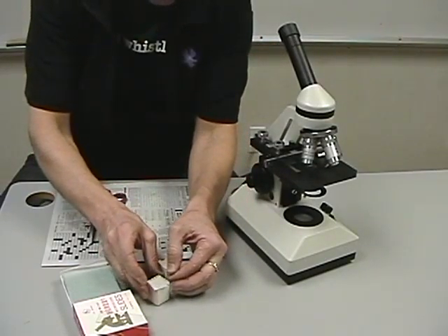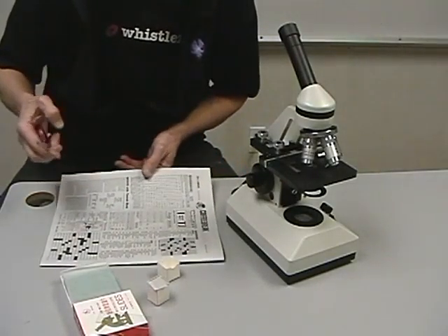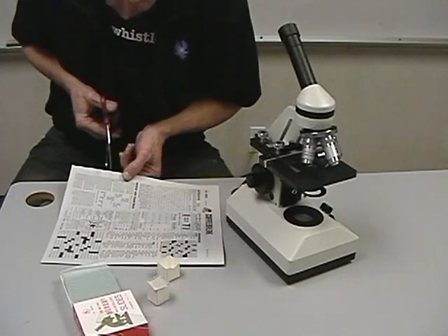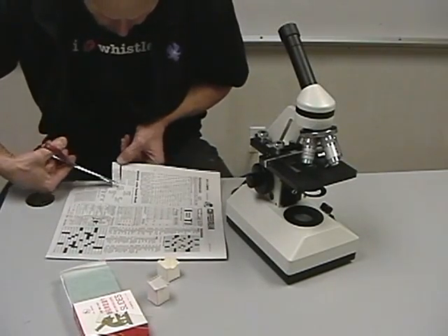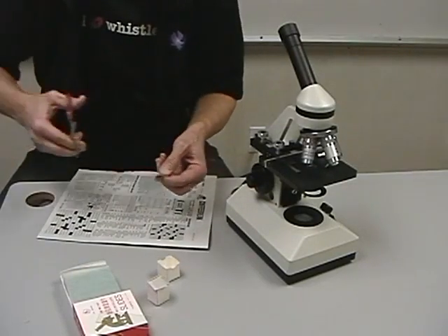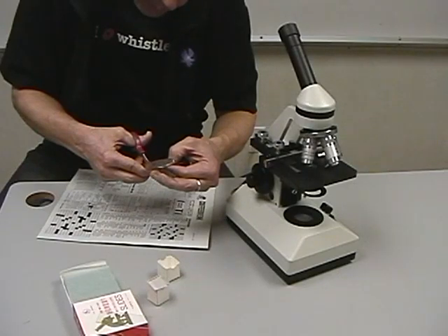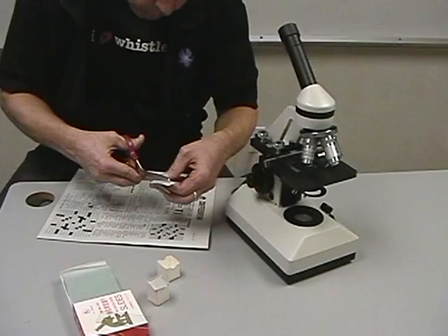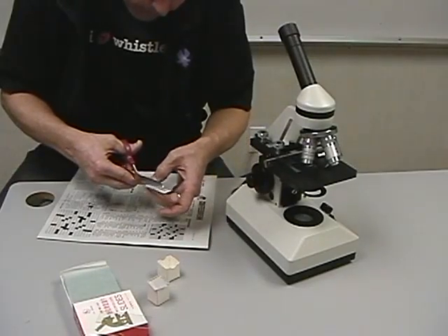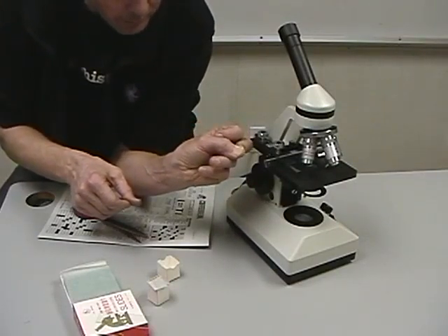And we need to have a pair of scissors, newspaper, and we find the smallest E that we can from here. So perhaps the easiest way to do that is just to cut a piece out of the newspaper, make it smaller. There's an E right there, and we just try to get just that letter E. And I've got one here. You can see it on my fingertip if you can.